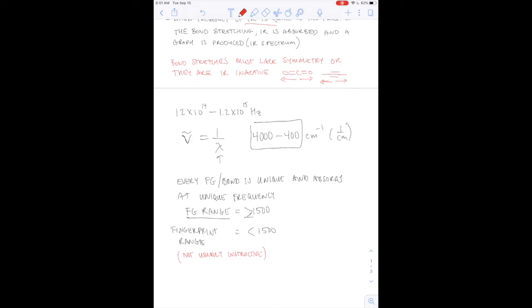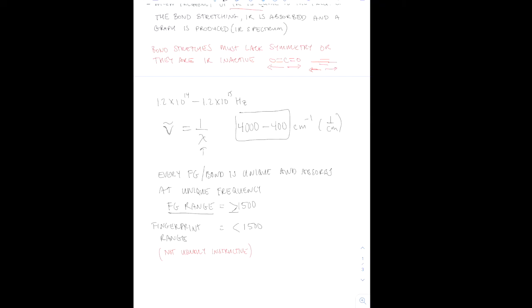Once you get into more advanced chemistry, you might focus a little bit more on that fingerprint region, but I want to say that we'll focus mainly on frequencies, or the wave numbers, above 1,500. But it is helpful to take a look at some common CO, CN, or CX bonds in the fingerprint region.